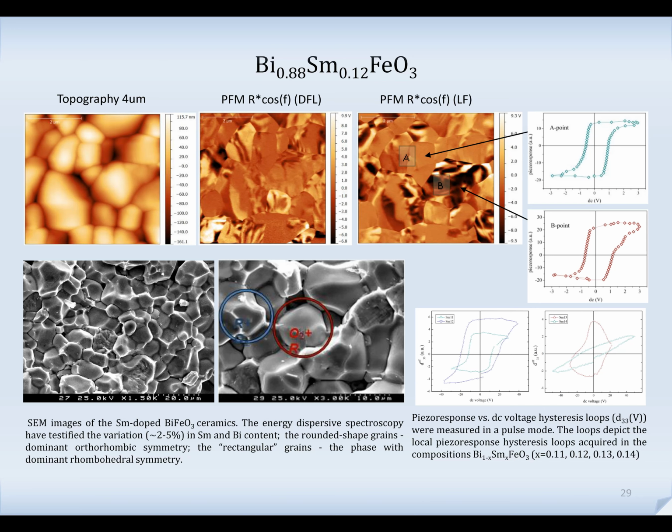For sol-gel compounds, where we have really small grains, nanometers, it's a bit different. Probably it's different also because of the polishing procedure. Before measurements, we polish it, anneal it, and use some chemicals.